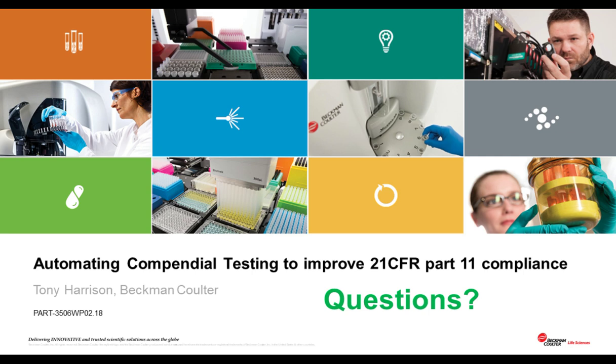Okay, let's go ahead and wrap up with this last question. How do I know if the technician used the correct compendial method on the HIAC 9703?